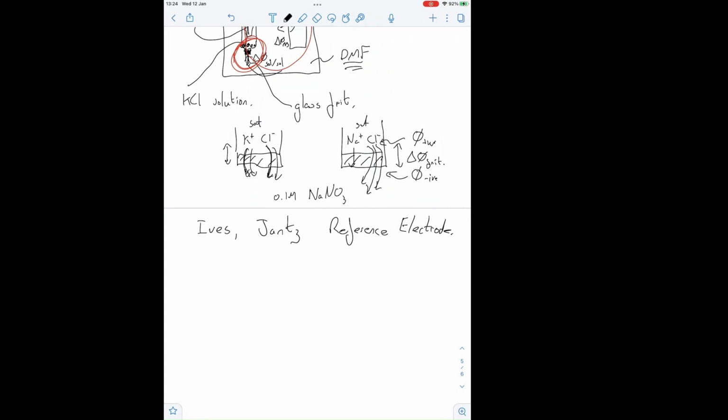And she couldn't get them right, or the results didn't seem to match what she was doing. We had a long discussion on this, and it turned out that she wasn't waiting long enough for the reference electrode to establish its potential. And the reference electrode, I think it was probably a mercury oxide, because of the nature of the measurements, was taking about half a day to reach a stable potential. And then the experiment worked. But if you just took the reference electrode, because it was drifting through the experiment, the other part of the experiment didn't work. So your reference electrode is very, very important to get accurate measurements.